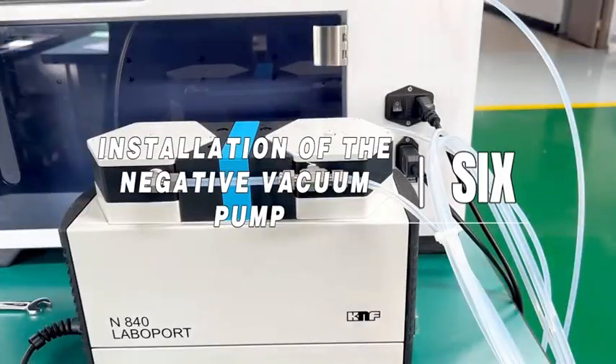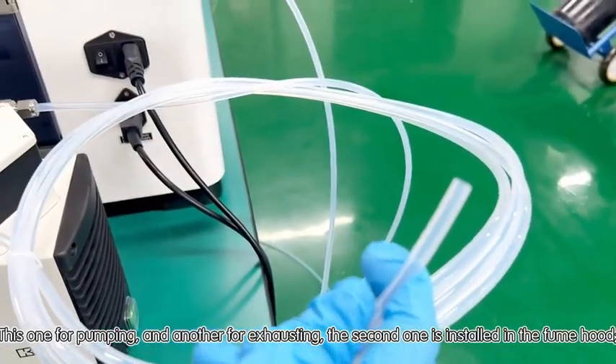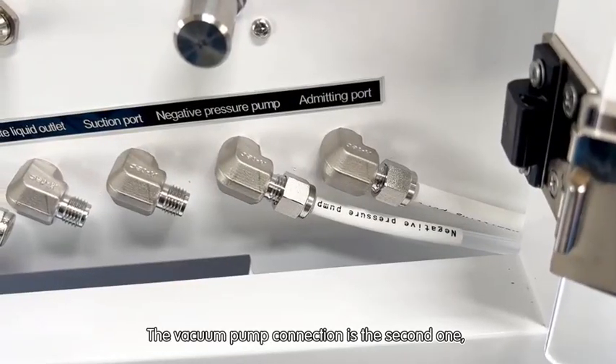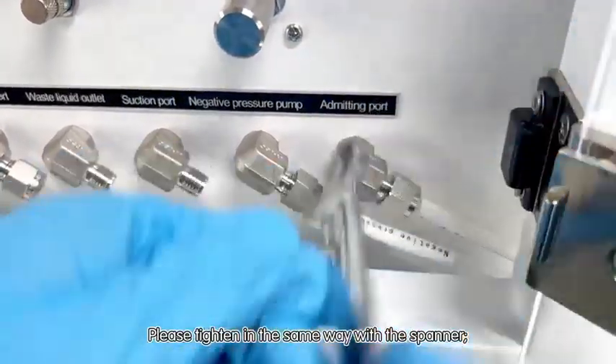Installation of the negative vacuum pump, step six. The vacuum pump has two connections: one for pumping and another for exhausting. The exhaust connection is installed in the fume hood. The vacuum pump connection is the second one. Please tighten in the same way with the spanner.